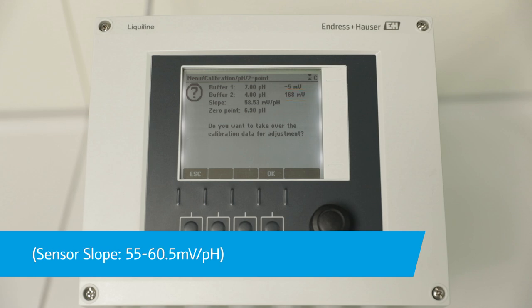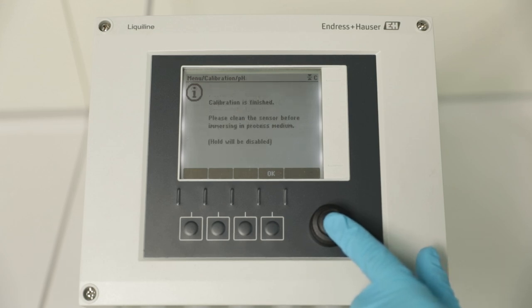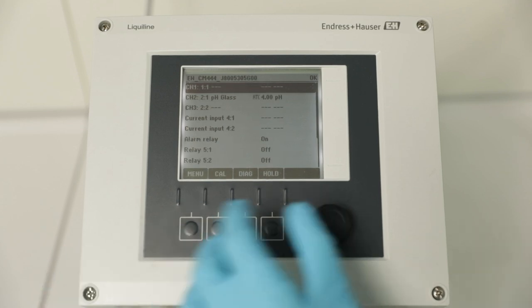The sensor slope should be between 55 and 60.5. If so, adjust the sensor by pressing OK two times and return to the measuring screen by pressing OK three seconds.